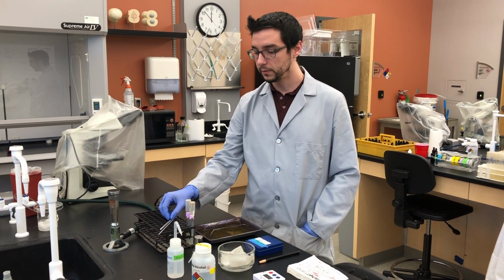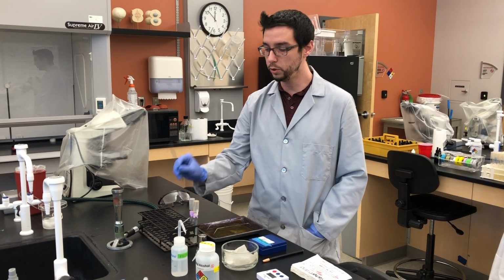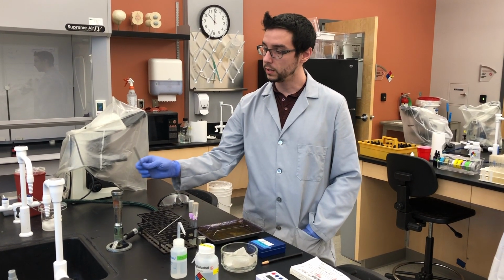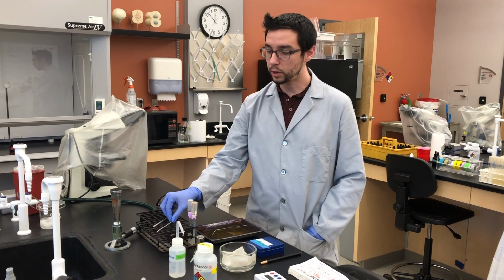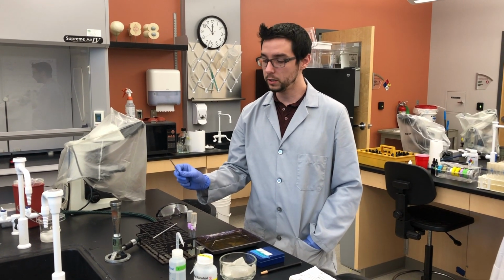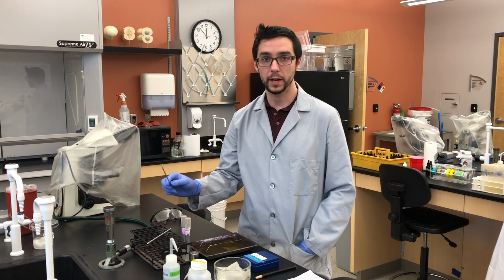When you do that, make sure that you're adding the water to your slide with your inoculation loop, sterile, then collect the solid culture with a sterilized stab, and then spread that around with the inoculation loop. It is critical, especially with some of these species such as the mycobacteria.